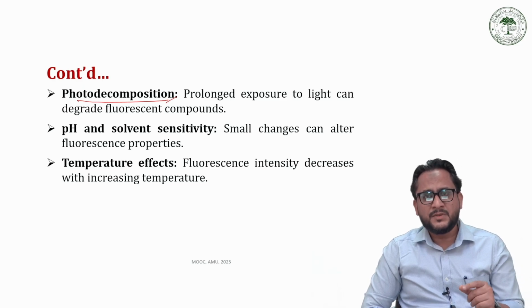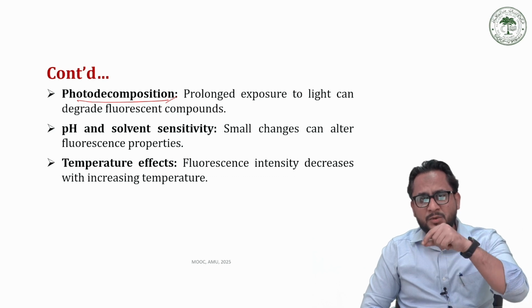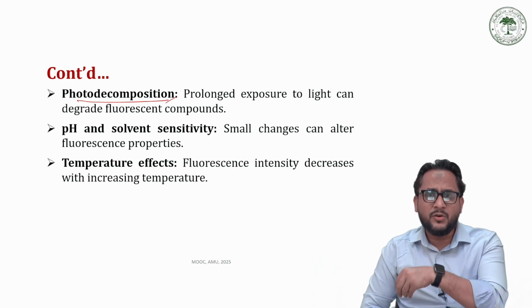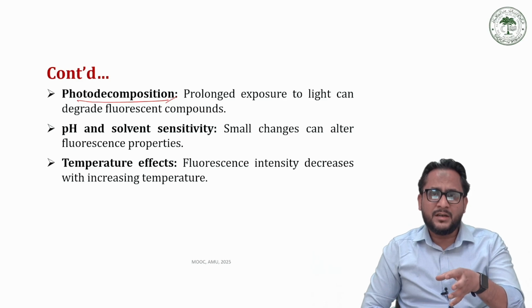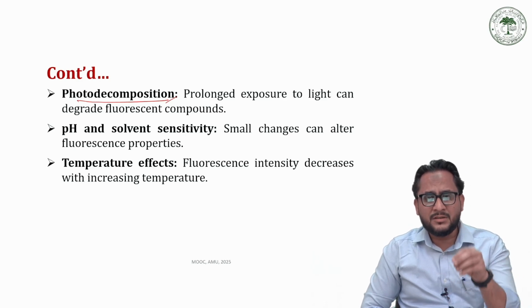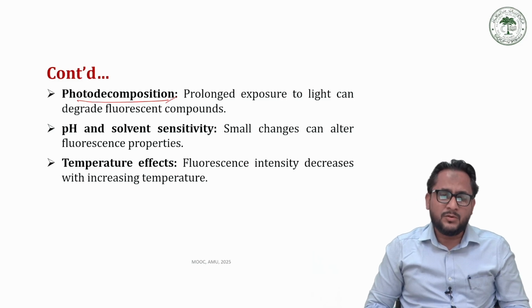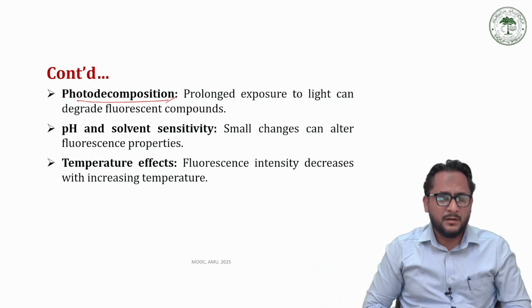It happens because of prolonged exposure of the molecule to the light used for irradiation to cause excitation, because that is a high energy radiation while the light emitted is low energy radiation. So when this high energy radiation is used for irradiation for a longer period of time, it causes decomposition of the compound. So it damages the compound. The total study is gone, meaning the total efforts are in vain.